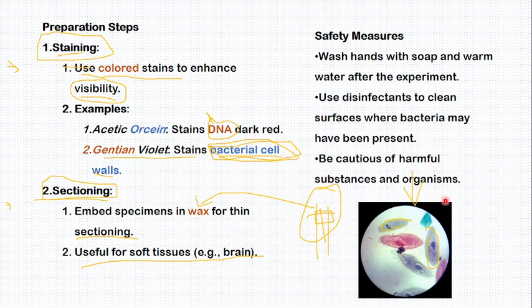the organisms. So I hope you are understanding how microscopy works. Apart from how a microscope works, you are understanding how to draw it. There are many parts. The types are light microscopy and electron microscopy. I taught you that light microscopes can be monocular or binocular, where you have one ocular or two. I taught you how to tell the difference between light and electron microscopy, and also the very important difference between magnification and resolution. How can you calculate magnification?